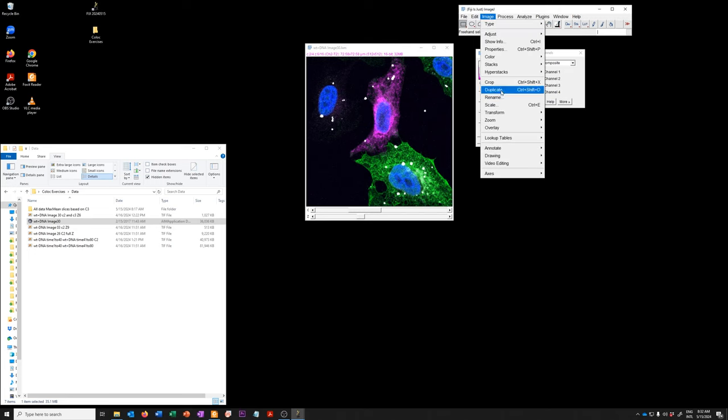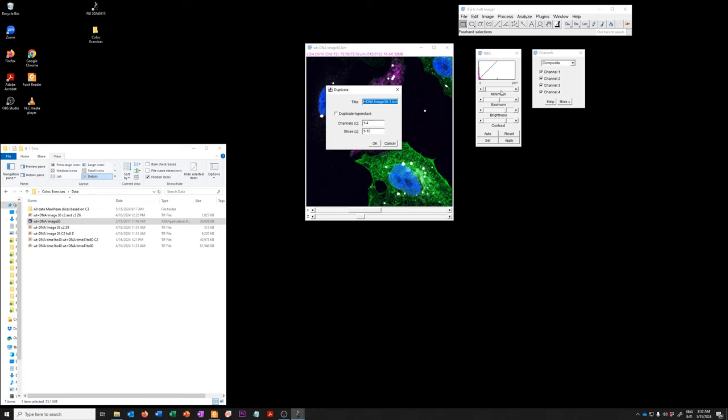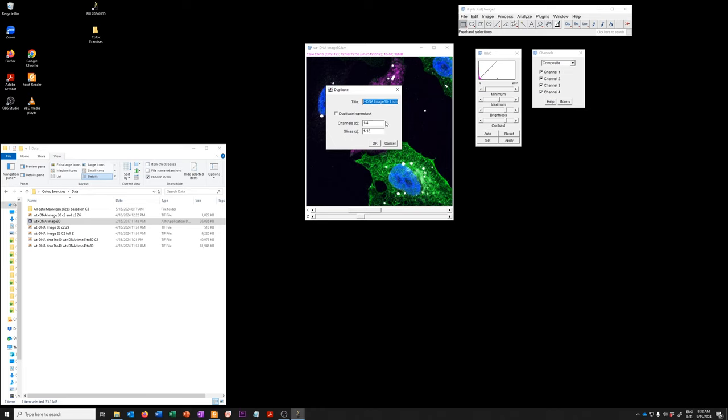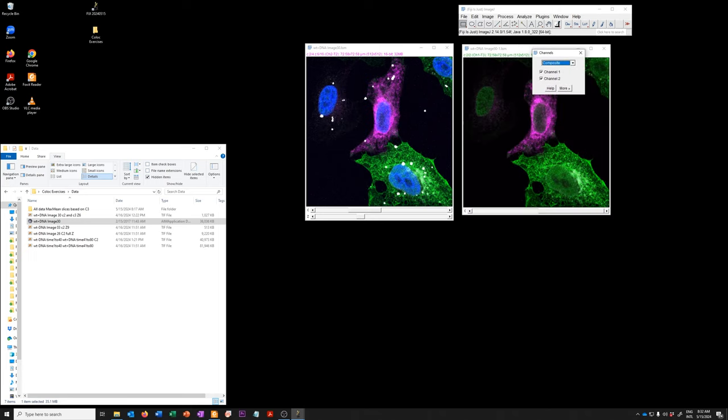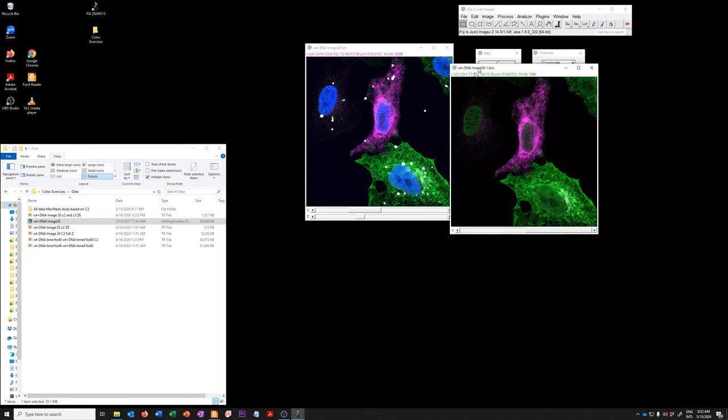which is what we're going to do right now. We're going to duplicate only channels two and three for slice six. Here you have it.